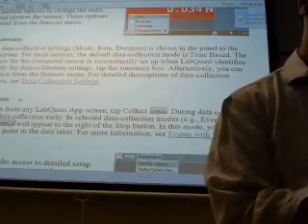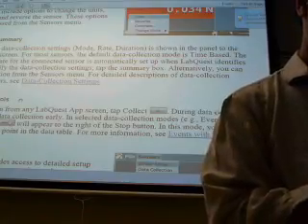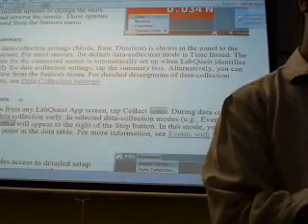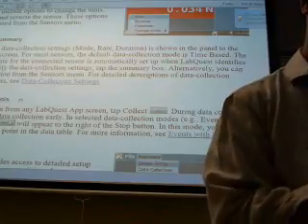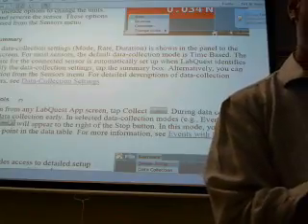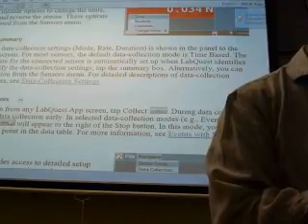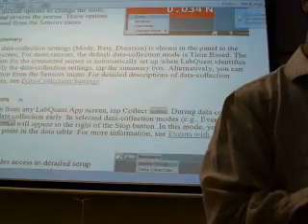We put file, graph, analyze. What do we click on to save it? File save. Then name it something. Just in the name box, just type in some name. Save.